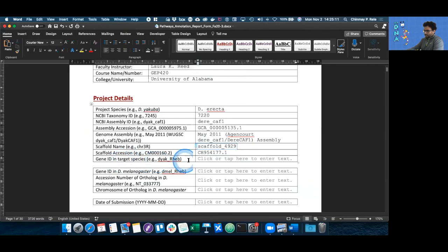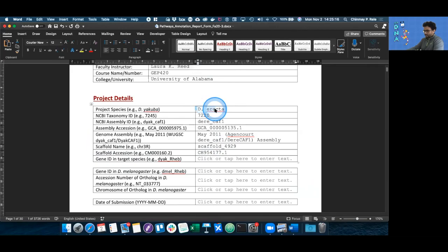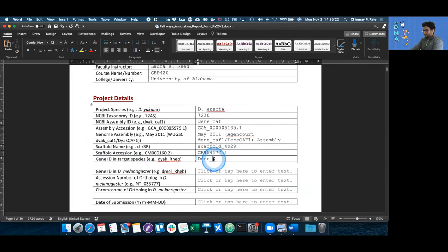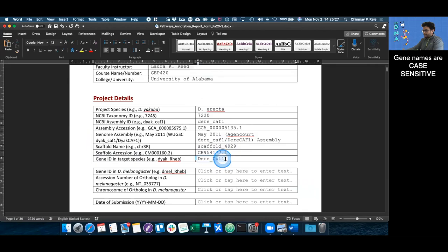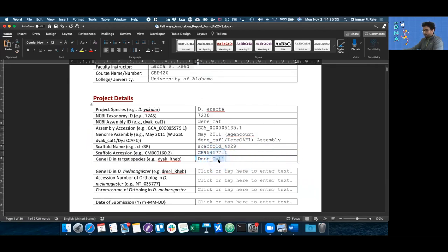The gene ID in the target species is going to be D plus the first three letters of your species, in this case erecta, so D-E-R-E, followed by an underscore and then the name of your gene. In our case, it's going to be CUL1. It's important to remember that the gene names are case sensitive. If there's a large letter, keep it large; if there's a small letter, keep it small.